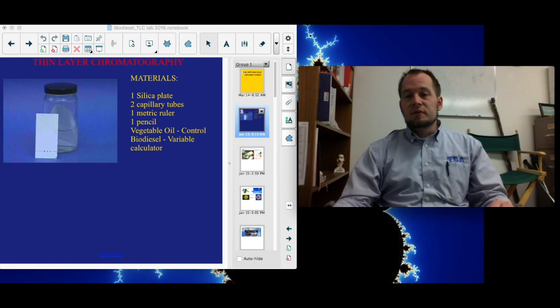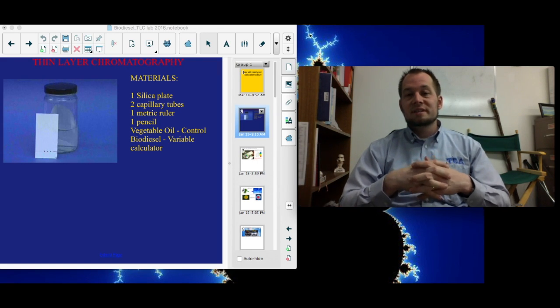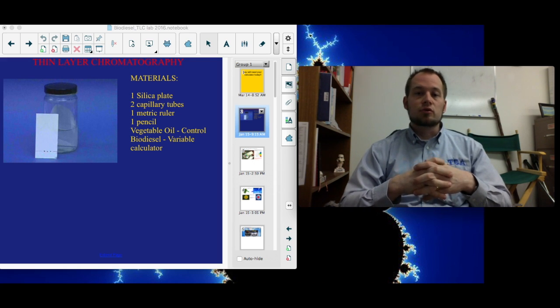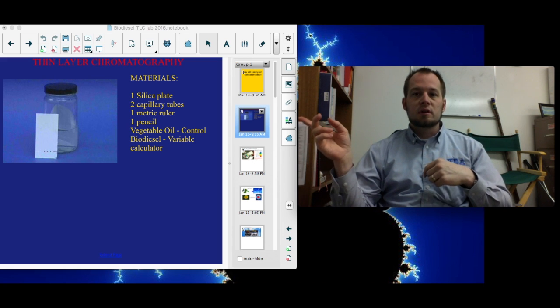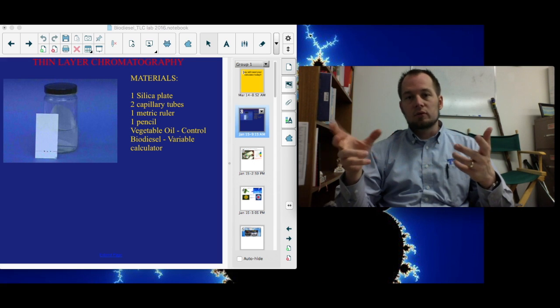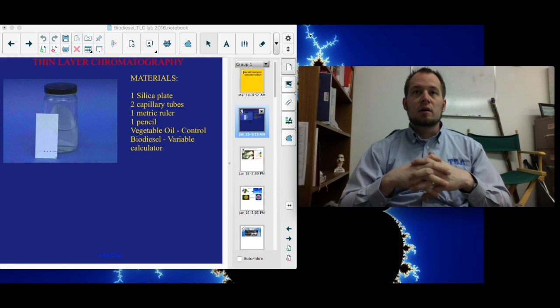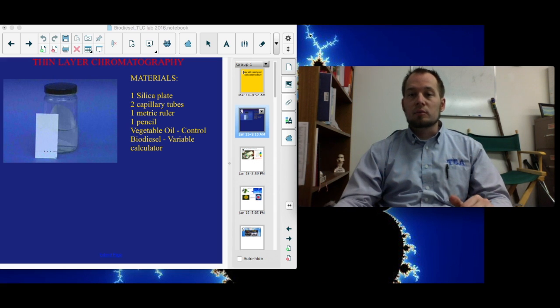Alright, the purpose of this video is to explain TLC. In this case, TLC stands for Thin Layer Chromatography. These notes, this slide, are posted on the website, so you can download those and follow along with this video where I explain what's going on. As I said, it stands for Thin Layer Chromatography, but let's see what that is.